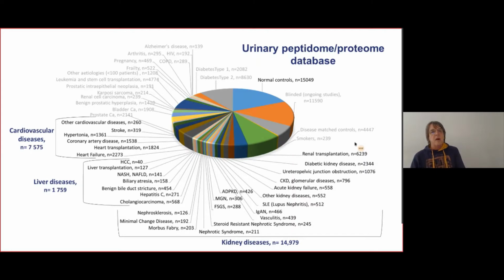And this is the nice part about the CE-MS, that all of these data sets are quite comparable, as long as, of course, they are urine and all sample prepared in the same way. And we can use all of these data sets to define biomarkers or to define peptides and small proteins associated with specific conditions, or also response to treatment.